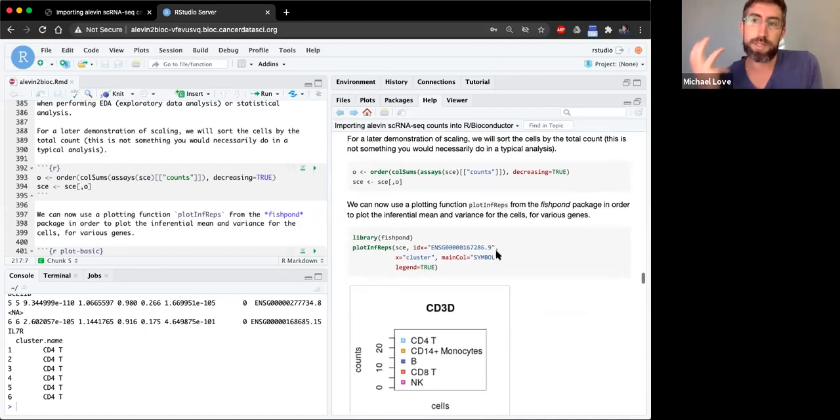But when we perform EM, we could be assigning these reads with a high uncertainty of which gene they assign to. So when we make use of the extra data, we also have to bring along information about that uncertainty. We've made some plotting functions in a tag-along package called Fishpond.